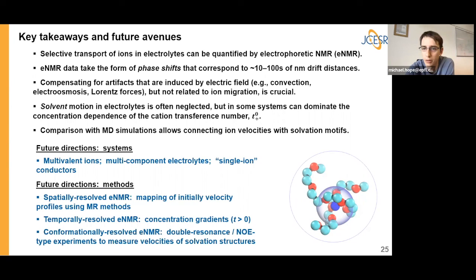Can you apply larger voltages to a solid potentially? That's a good question too. I have really not thought about that very much, but you would think so. You would think that if you caused any kind of degradation, at least it's not going to come into the middle of where you have the coil and disrupt the measurement that way. So that might also allow you to go to really high voltages. Sounds like an interesting experiment. Yeah.